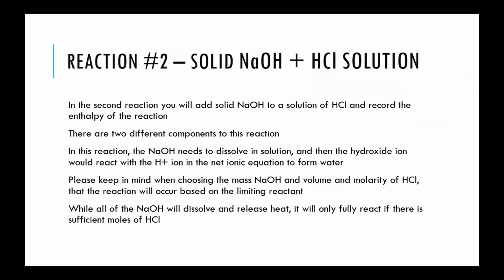The second reaction is a combination reaction. You're taking solid sodium hydroxide and reacting this with a hydrochloric acid solution. There are two different steps or processes happening when this action is performed. First, the sodium hydroxide is dissolving.